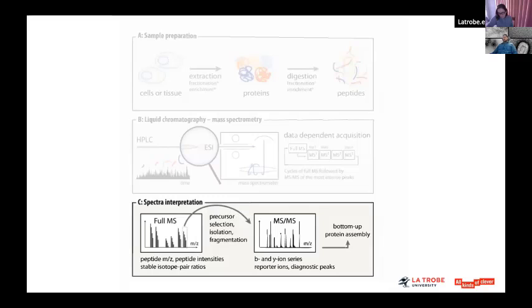So imagine that we have our fragmentations. The fragmentations need to be put into peptides, and the peptides now need to get back into proteins. So you can imagine this big jigsaw puzzle made out of hundreds of thousands of pieces, and if we consider a full proteomics analysis, we are talking of millions of these little pieces. So really the bioinformatics becomes a very important part of the analysis.